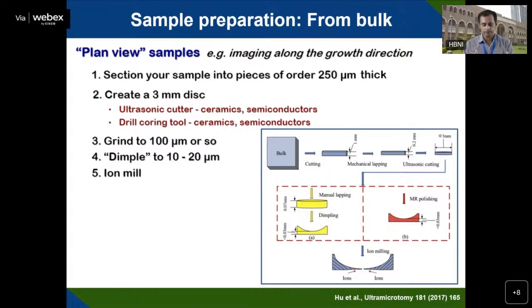But the most important thing for the TEM is sample preparation. If you can prepare a better sample, you will get a good result. TEM is time consuming, it is highly costly equipment, and you have to pay quite a lot for TEM analysis. For that, you have to train on sample preparation, which is the prime objective for TEM analysis. If your sample preparation is not good, you will not be able to get anything on the TEM screen. For example, with a nanoparticle, you will end up with aggregate structures instead of individual nanoparticles, so you are not able to see them. So sampling is of prime importance.